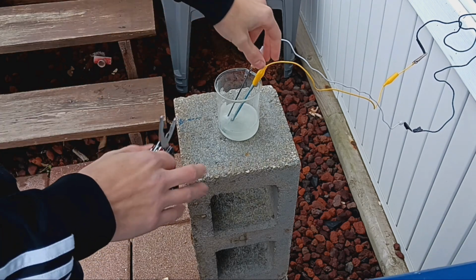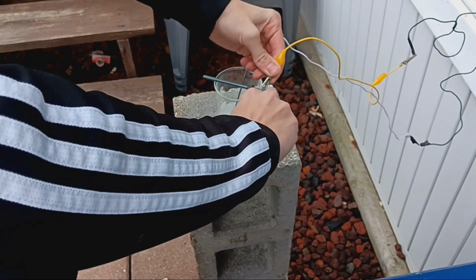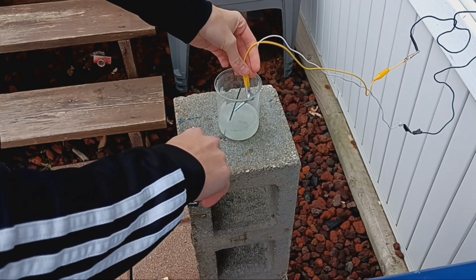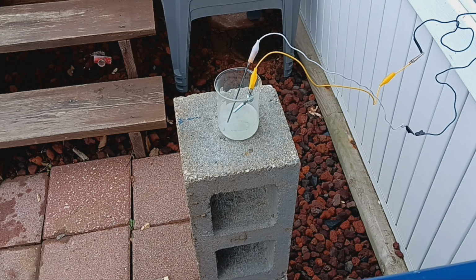Here I am flipping the electrode. The reason I did this was so I could speed up the production of metal oxides in the liquid. As one end of the electrode oxidizes, it loses its ability to further oxidize, slowing down the process. So in order to maintain operation speed, I have rotated the electrode. I think this clip has the best sound of the bubbles.